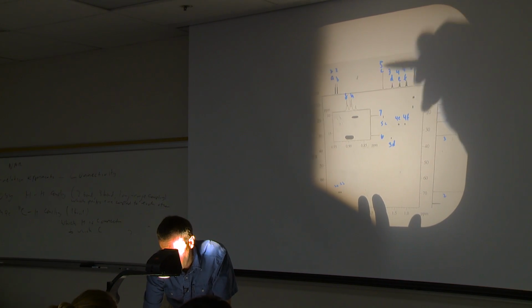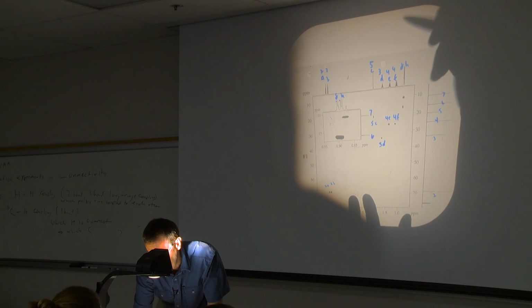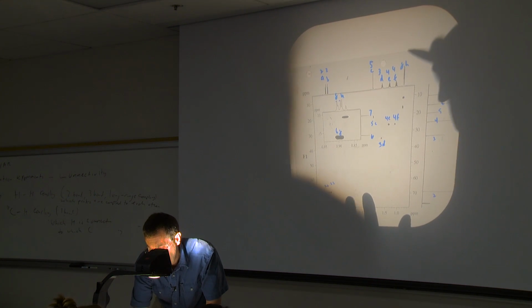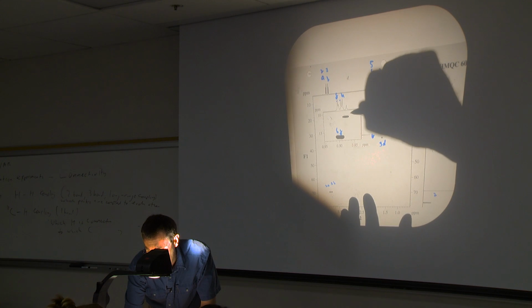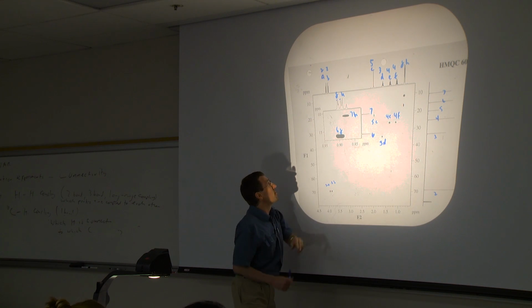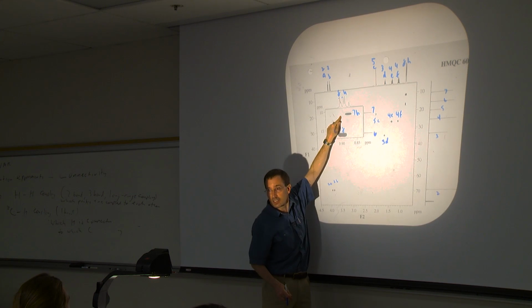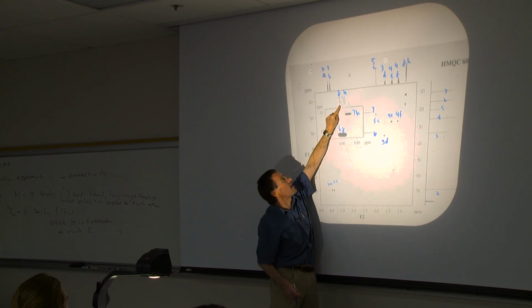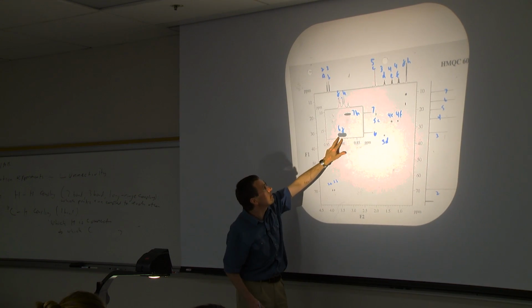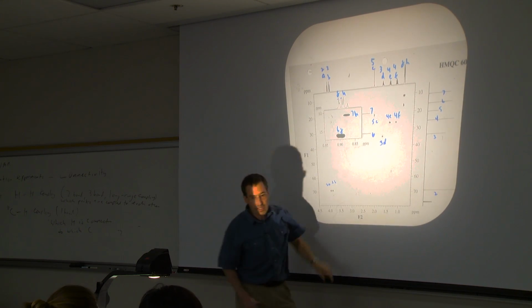In other words, that doublet that looks like it's G, this line and this line, shows up as 6G, and that triplet shows up as 7H. Now, I've got to tell you, I got this from a book called Silverstein. They did cheat a little bit. This cross peak actually should extend out to here. I think they doctored their spectrum. I've seen them do it in a couple of other cases. So it should come right under the triplet. But you can see which lines up. The 6G lines up here, the 7H lines up there.